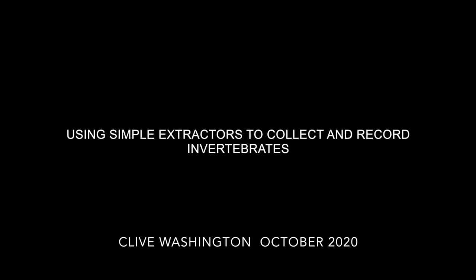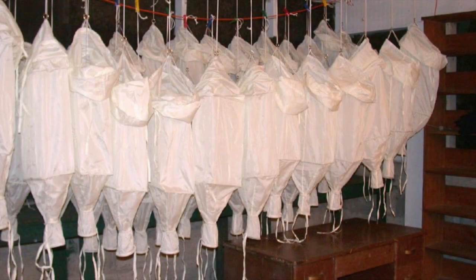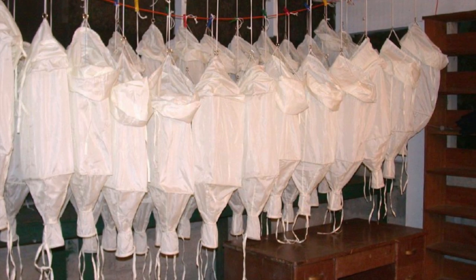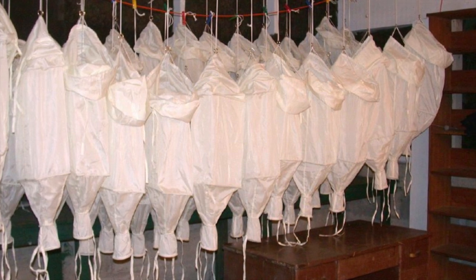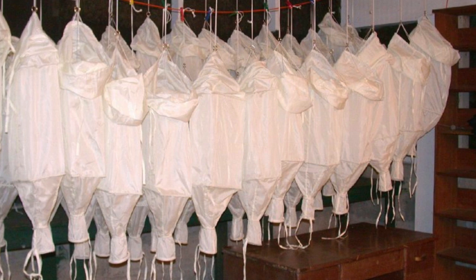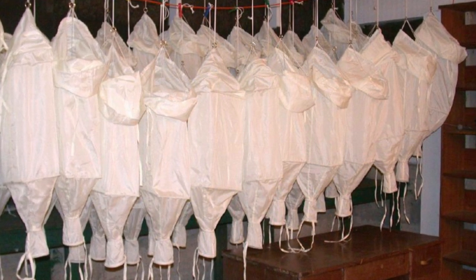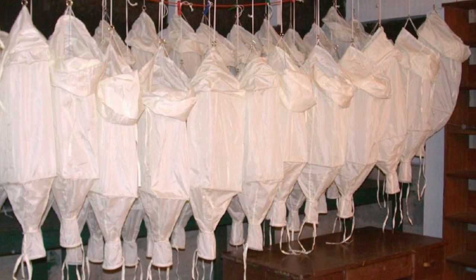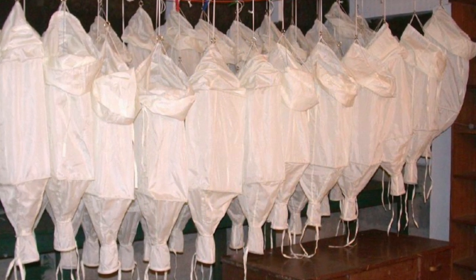This is a demonstration of how to use an extractor for the efficient collection and sorting of invertebrates from a variety of habitats. The professional form of extractor is the Winkler Extractor, which consists of a canvas bag into which you can put smaller bags of litter. Invertebrates fall out of the mesh bags and into the collecting jars at the bottom. These are expensive, but widely used by expedition people because they conveniently pack flat for transport. I'm going to show you some much simpler and cheaper alternatives.